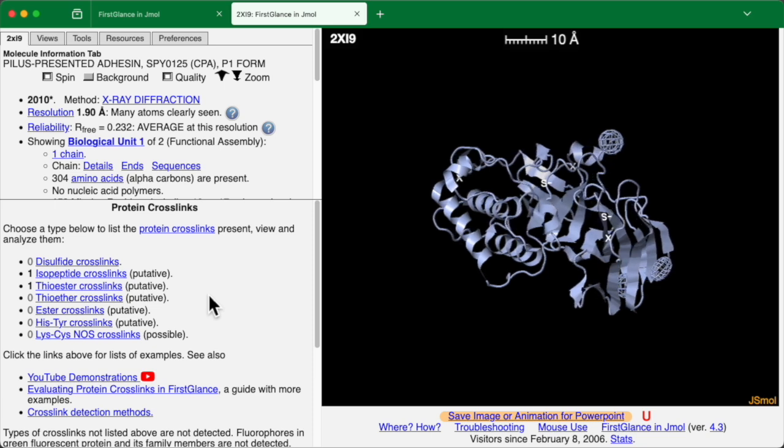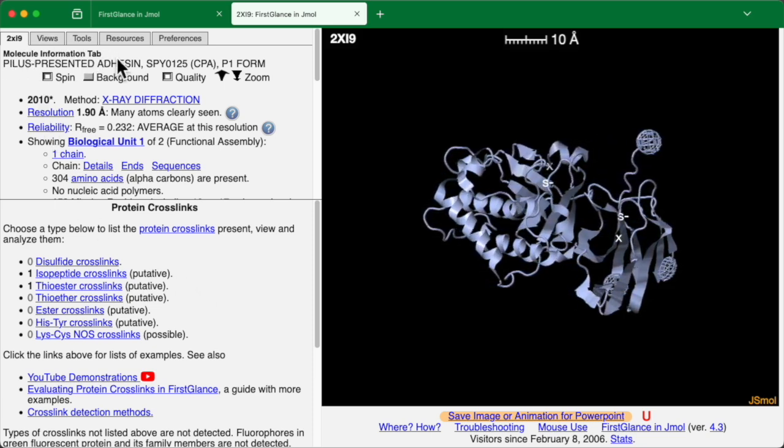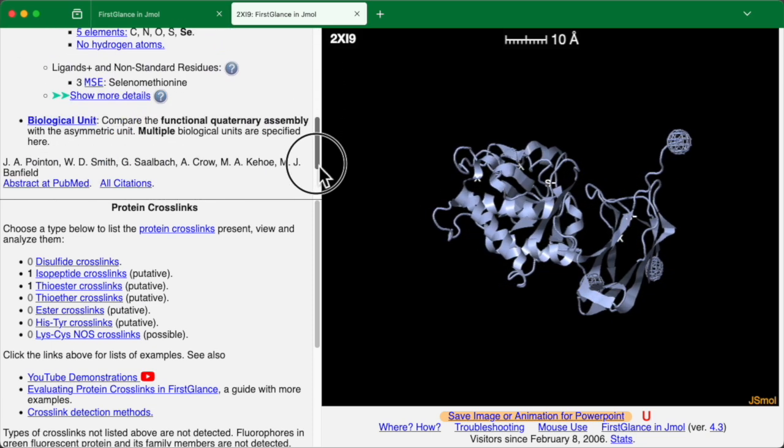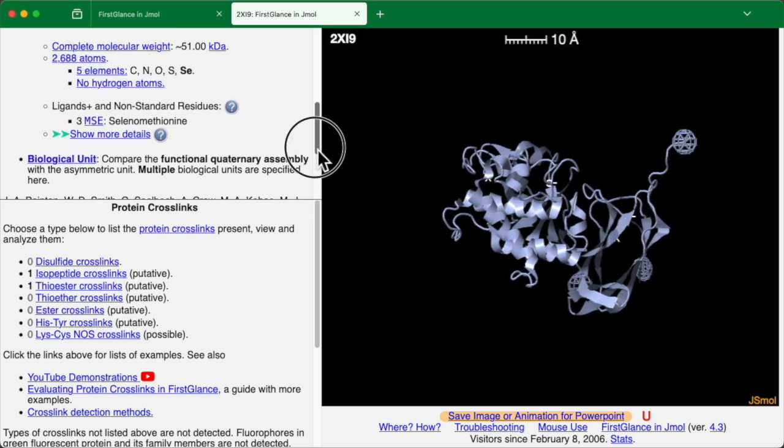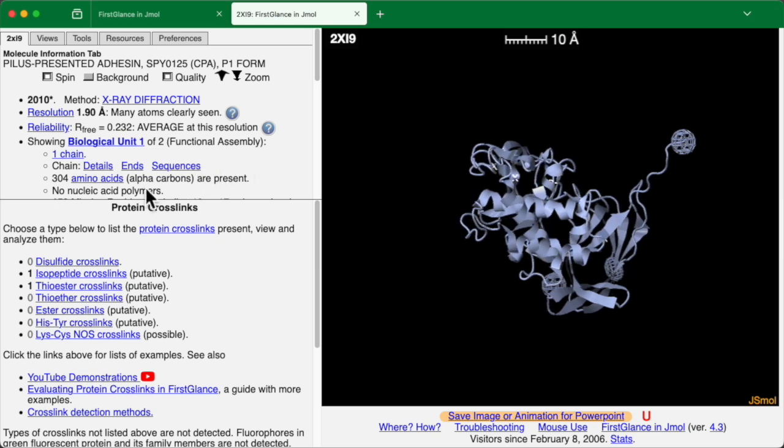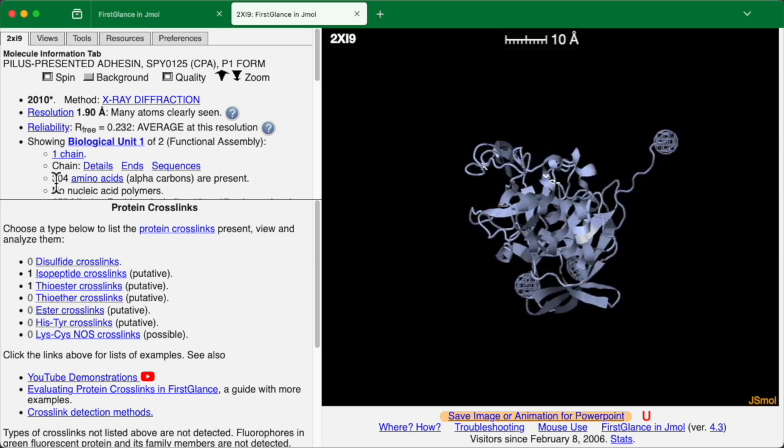Before we move ahead with that, if you've used FirstGlance, you know that up here in the molecule information tab is a wealth of information about this particular molecule. Not only what is shown in this panel, but the links here go to information in considerable depth.